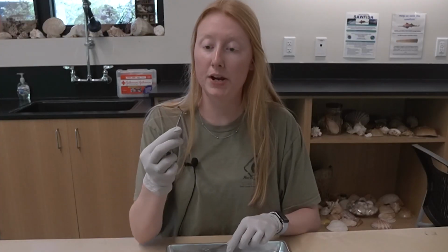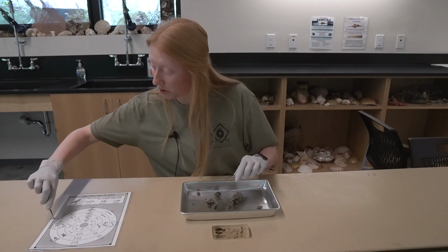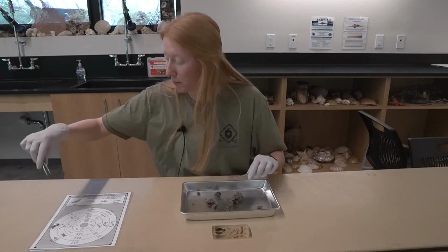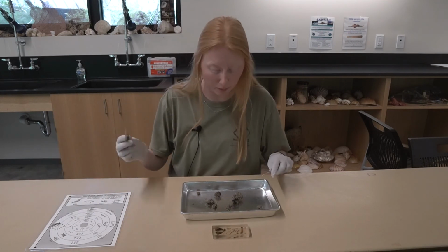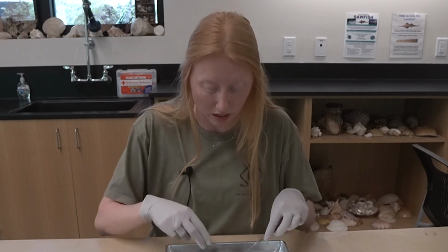So here's a bigger leg bone. You can see the joints and where some connective tissues would be. Still got fur on it and everything. So this could go right there. So a very big hind leg of a large, probably, I would say a larger rodent, but I'm going to put it outside since it's a bigger one. I don't believe that would have belonged to a bird just because it is so big.